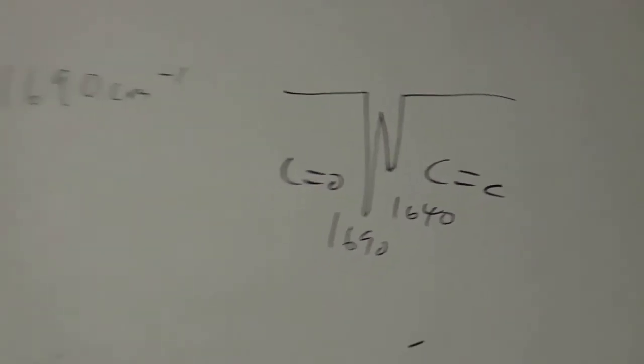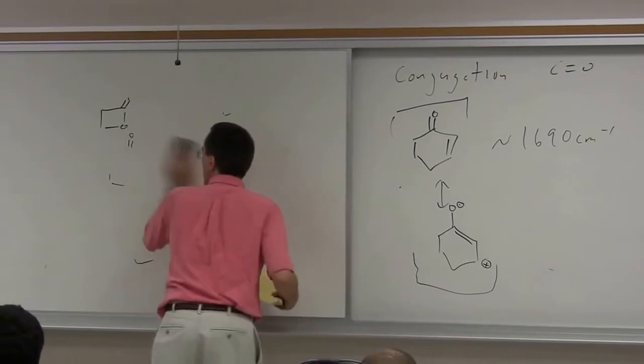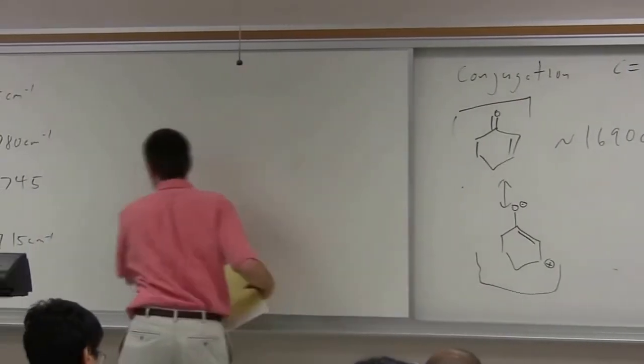All right, one last category to play with, and that's electron withdrawing groups.